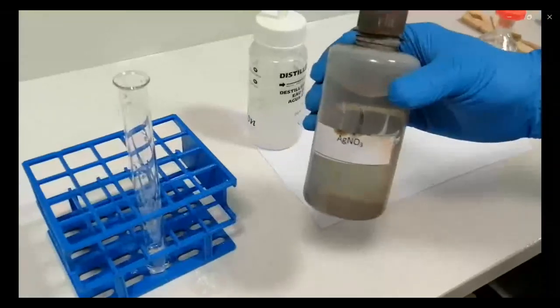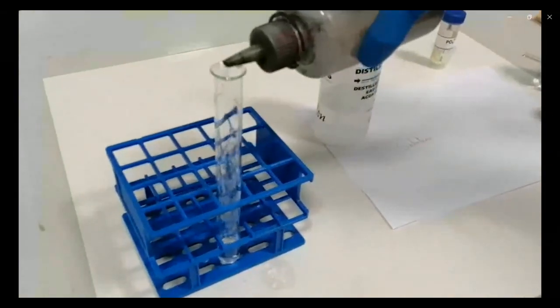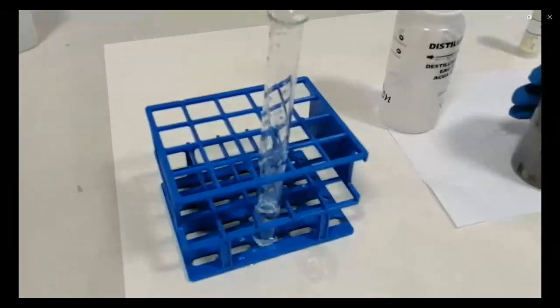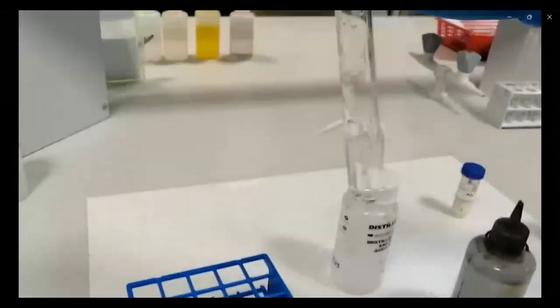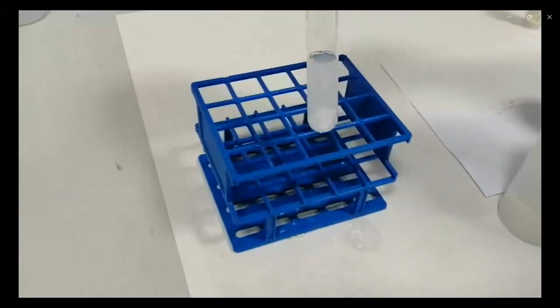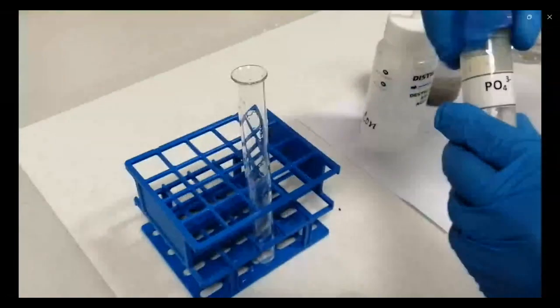Then add silver nitrate. In case of sulfate, you will see a white precipitate. Just mix them very well. You will see the turbidity, which is silver sulfate.